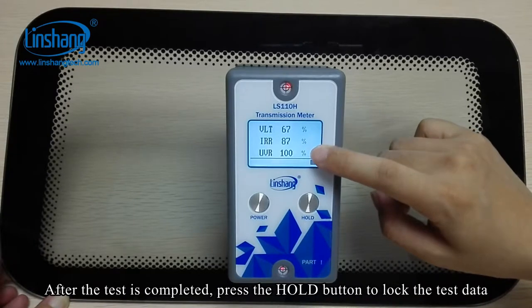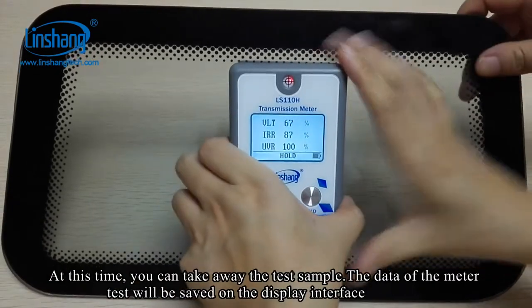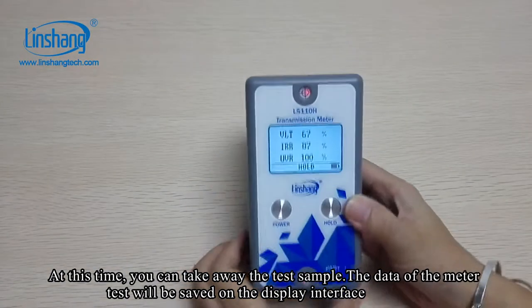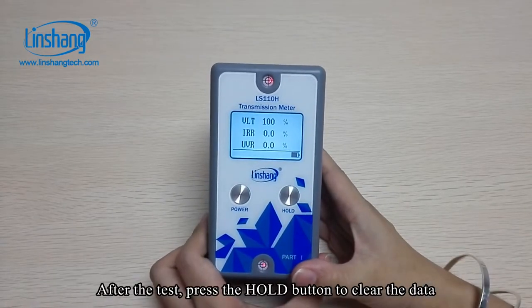After the test is completed, press the hold button to lock the test data. At this time, you can take away the test sample and the data will be saved on the display interface. After the test, press the hold button again to clear the data.